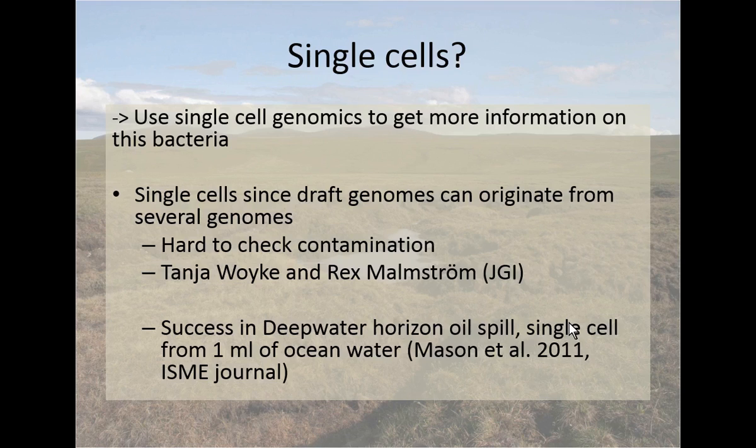So I decided to work with single cells, and I did this with Tanja Woyke and Rex Malmstrom from the Joint Genome Institute. Something that really made me want to try this was that a colleague of mine, Olivia Mason, was really successful with just one milliliter, so like this much, of ocean water, to get single cells after the Deepwater Horizon oil spill.